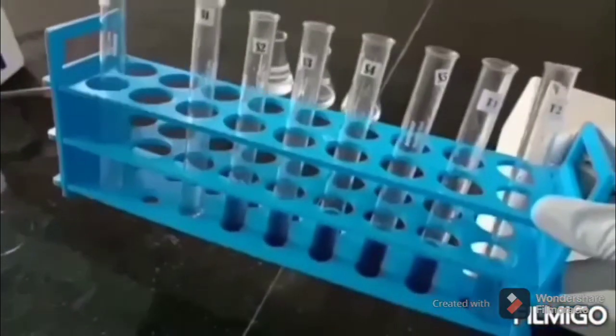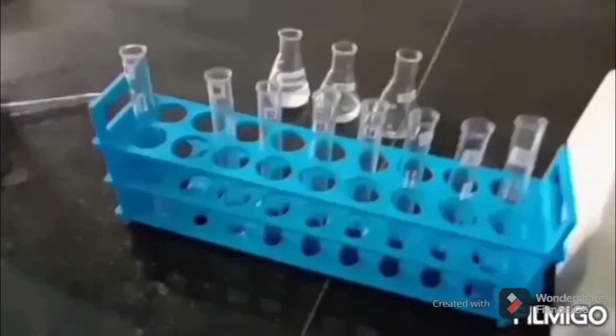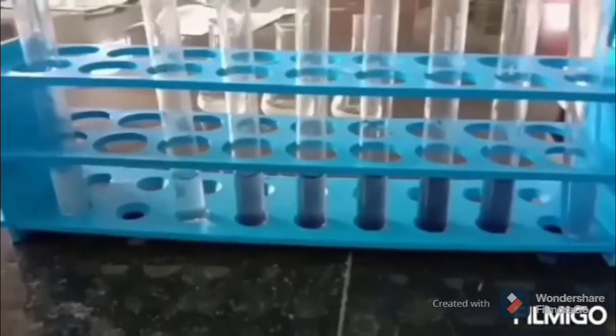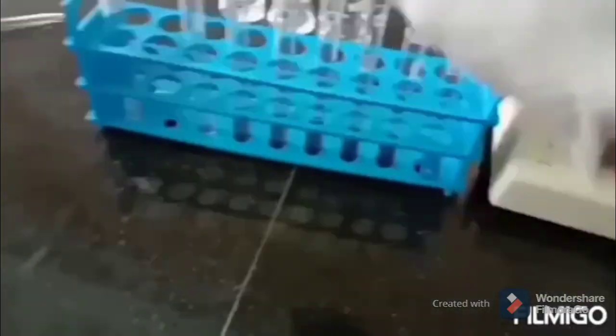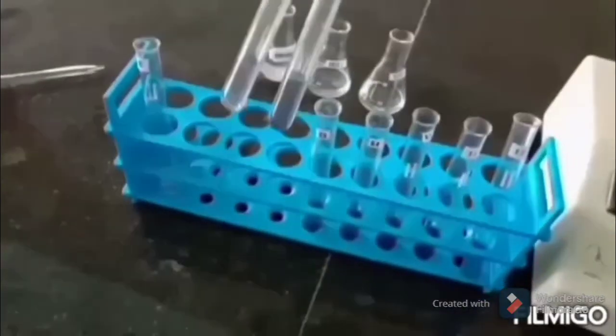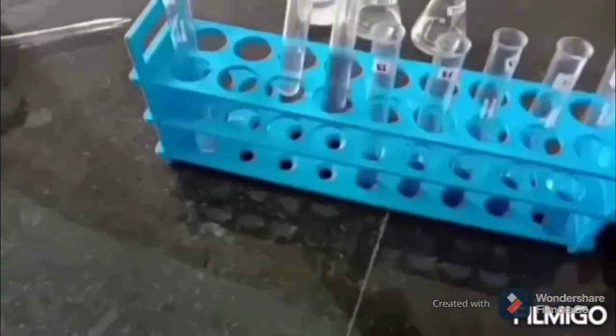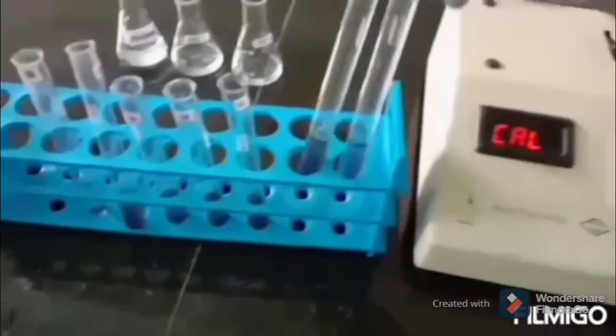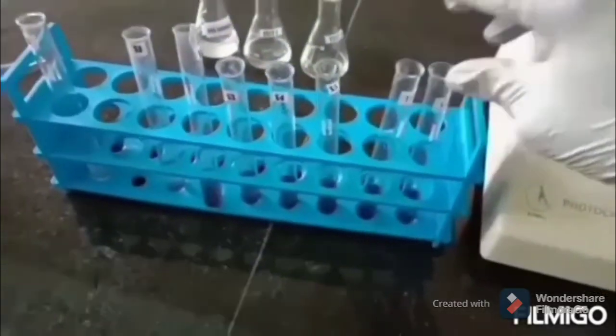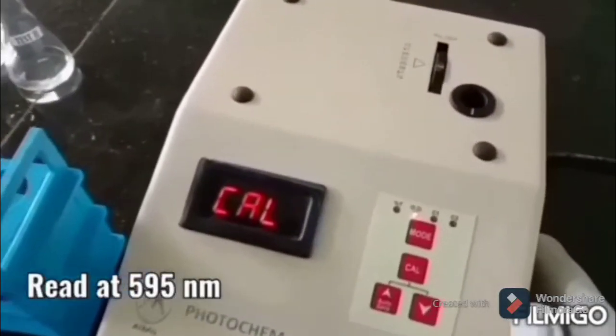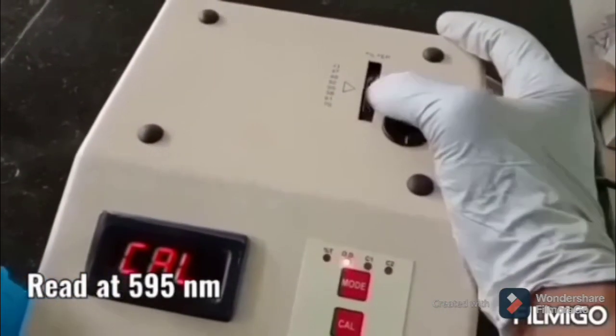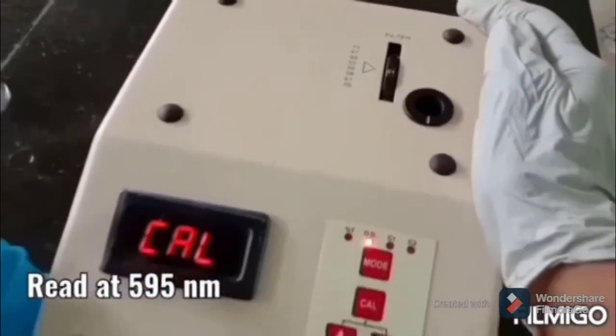After boiling, as you can see, a deep blue color is developed in standard and test solutions. This is S1 and S2, you can see the color development, as well as T1 and T2. Now the readings are taken at 595 nanometers using a colorimeter.